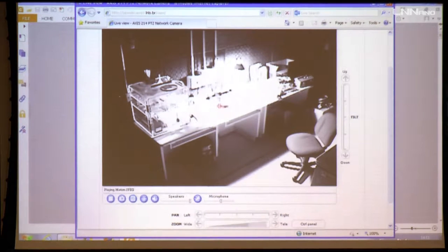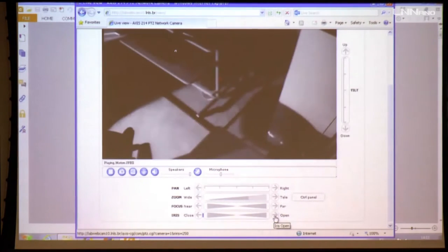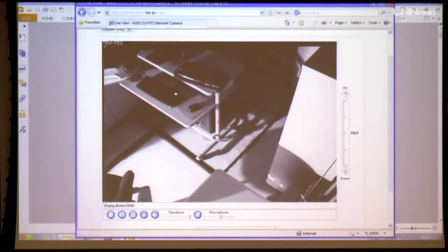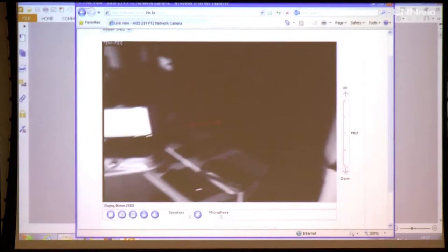I think I need to show you the vacuum system as well. This is the one. This is the vacuum generator from air conditioning. From here, we get really controlled airflow to the room. As someone mentioned yesterday, the temperature can only be increased by 0.1 degree centigrade in 1 hour. So if we want to increase the temperature of the room, we need to wait 24 hours to increase it by 1 degree centigrade. It's a really very controlled environment.